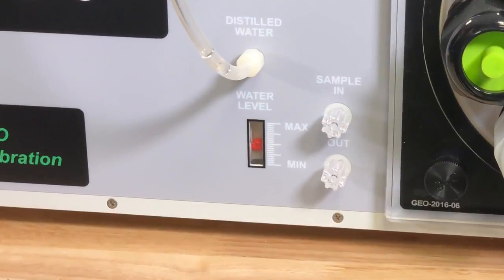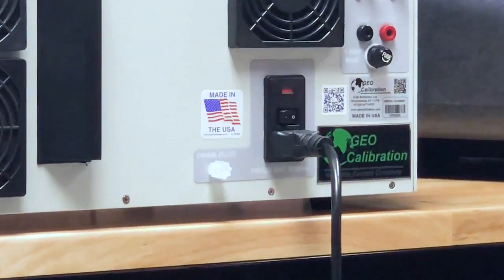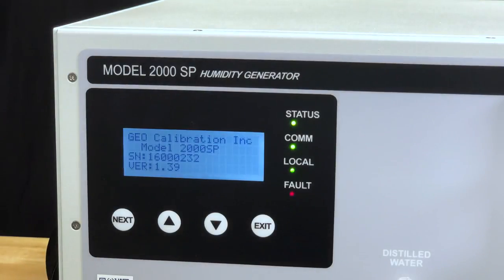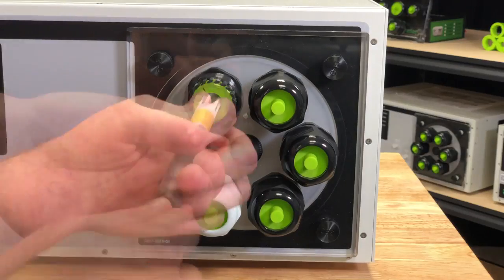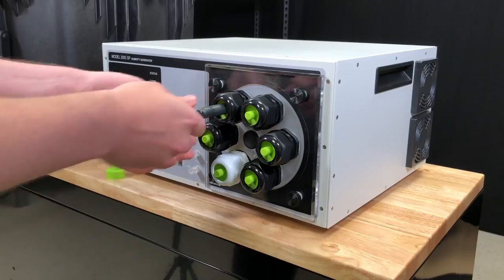Once the unit is filled with water, remove the fill tube and secure the fill cap. Plug the unit in and turn the power switch to the on position. The unit is now ready to be used. You can accommodate any standard hygrometer by removing the port cap and replacing one of the plugs with an appropriate diameter bung. Replace the port cap, turning it clockwise until the bung is secure around the unit under test.